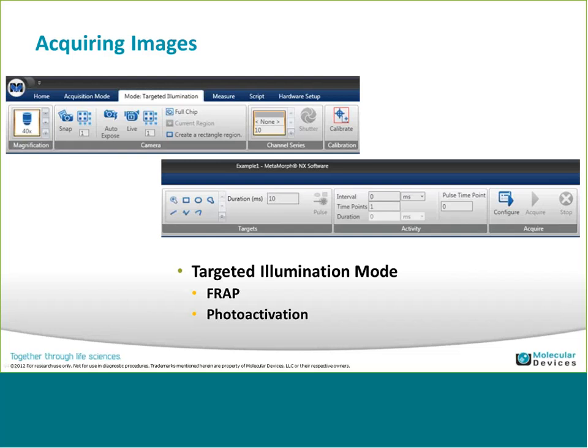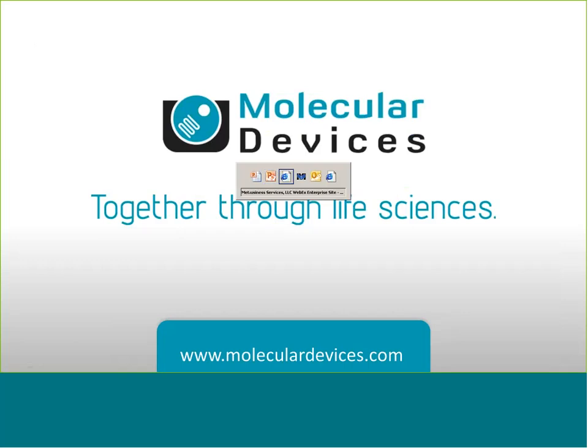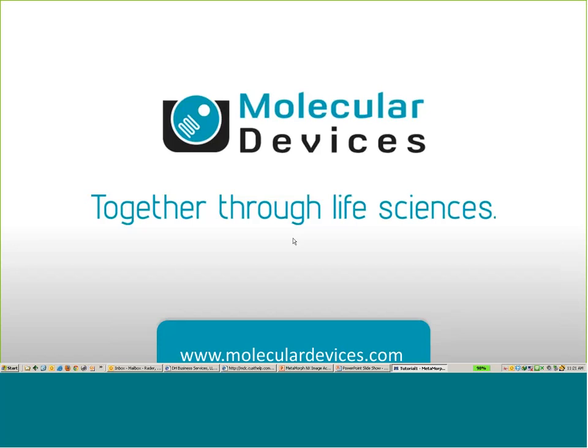So notice now my data set views, initially I had 2, now I have a 3rd one in this list. If I come in and do another series of snaps, so snap my green, snap my red, and snap my blue, now I have another set of 3. And if I do save into groups, I can add it to my data set, and it's going to add it as a new stage position. So currently, my data set 1, if I go to the Home tab here, only has a single stage position. There's your data sets here, so it only has a single stage position.